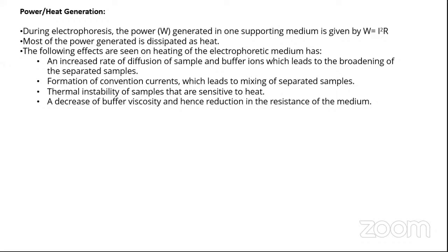You have two options, buffer ions. Did you get the question, first of all? So what is the consequence that we are getting to with increase in voltage, with increase in current, with increase in power, with increase in temperature, that is heat generation?